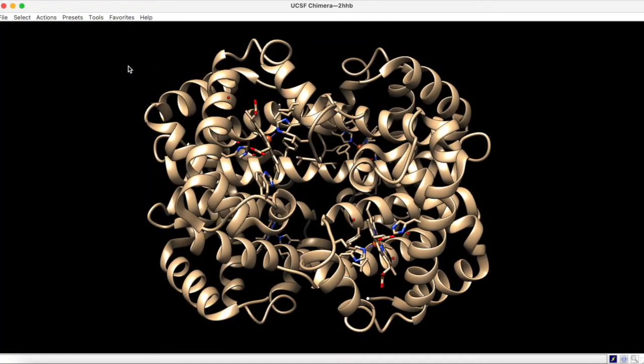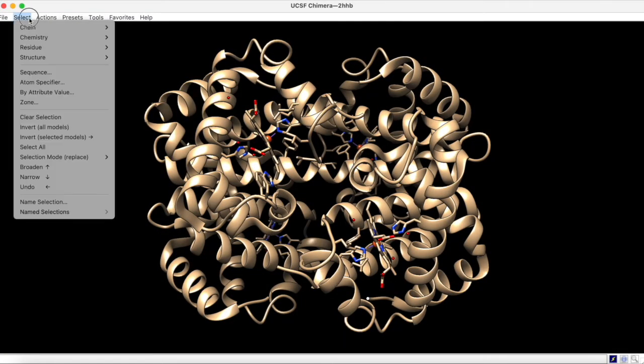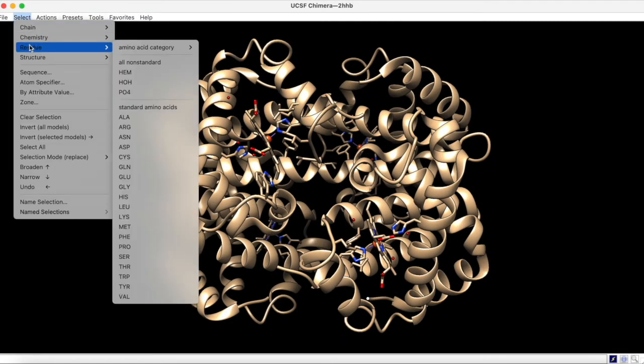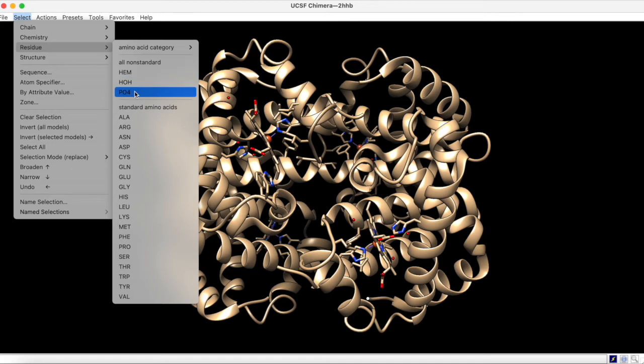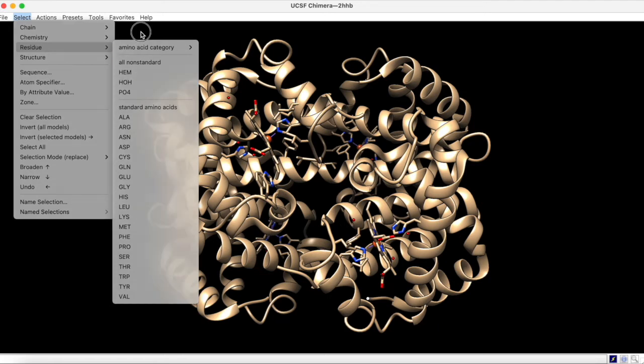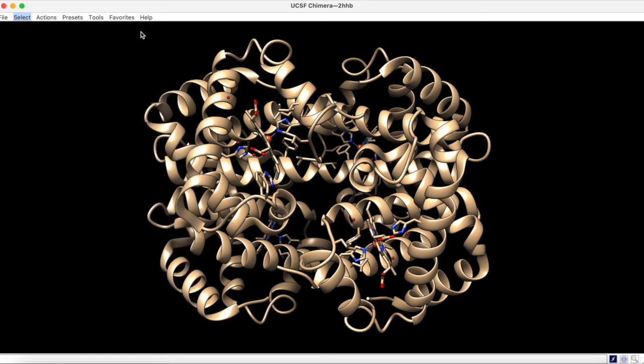In Chimera, these ligands are accessible under Select, Residue, and All Non-Standard. Here, we see the same abbreviations from rcsb.org. HEM for heme and PO4 for phosphate. Chimera also includes water molecules as HOH. With this knowledge, we can now continue to explore selections in Chimera.